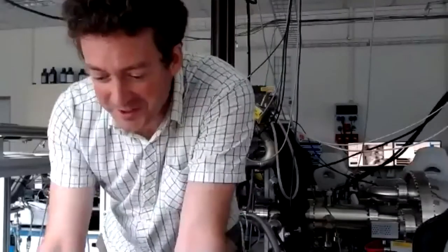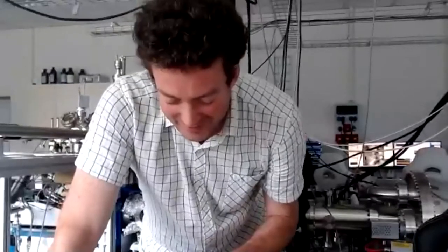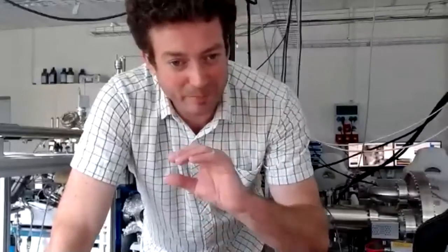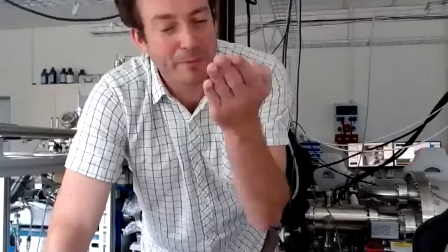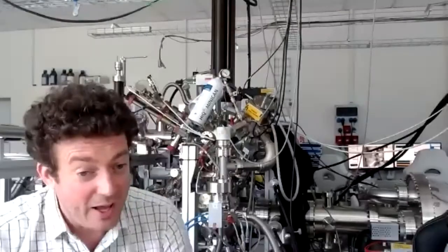And when you transfer from the NAP-XPS chamber to the STM, AFM part, does it stay on the same holder? Good question. Actually, that's not compatible, because the STM part, which is also near ambient pressure, has to have a special double-decker holder, because you put the sample upside down and you bring the tip close to it from the bottom. And the size is the same.